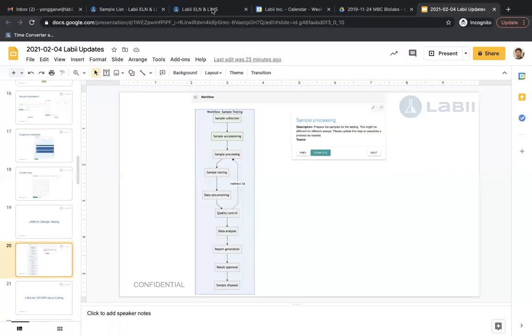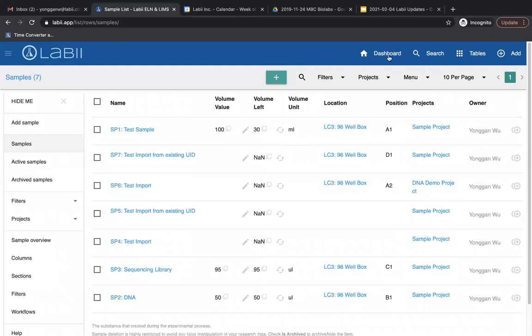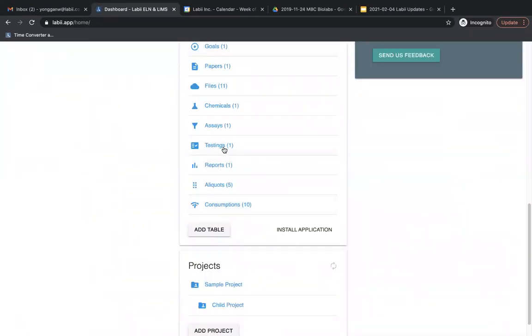So with that, I can also give you a live demo. So I will just go to the testing tables.